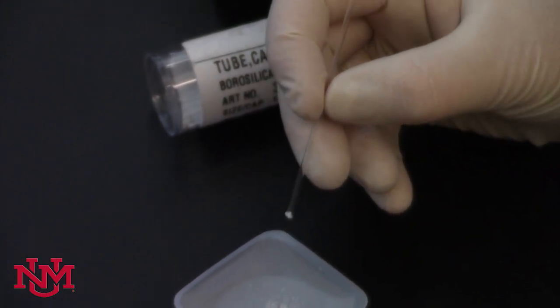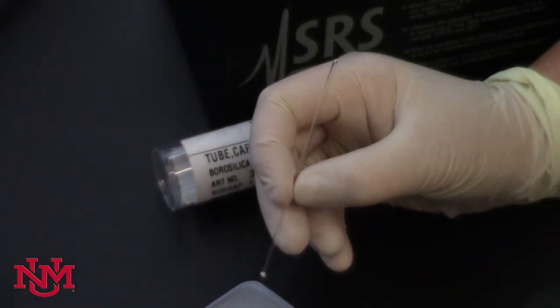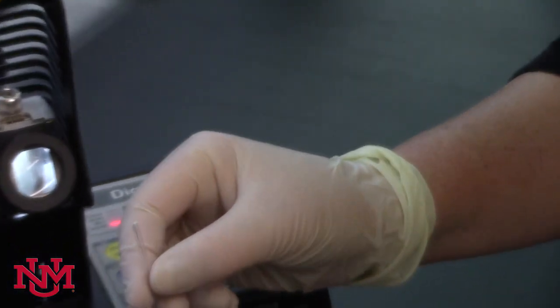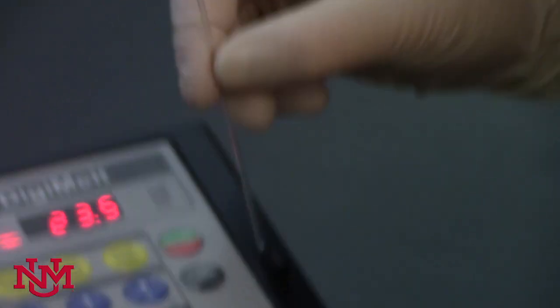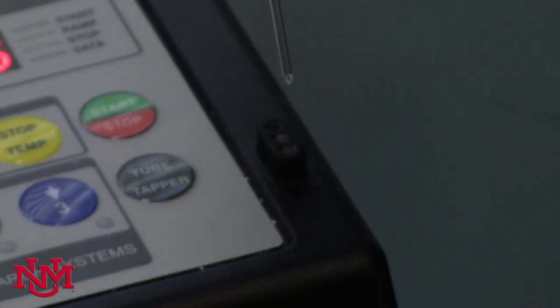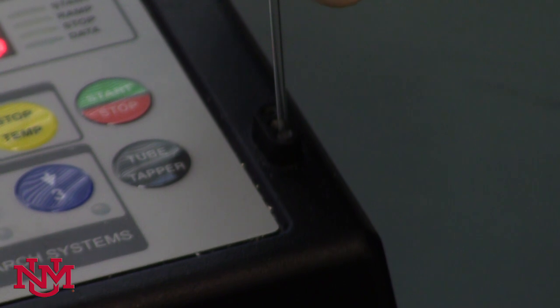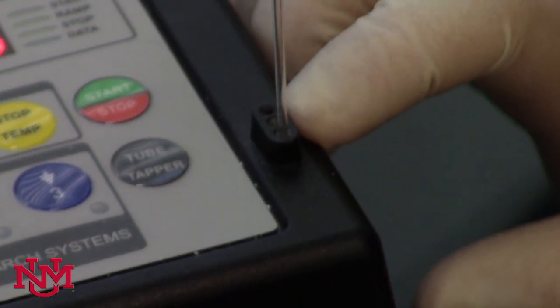Then you'll come over to the digi-melt, turn it upside down so that you have the sample's sealed end pointing down, and place it into one of these three slots here.